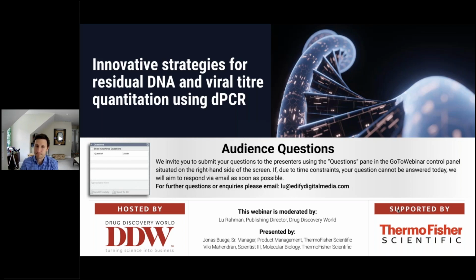Okay, thanks, Jonas. There's one final question that's just come in. Which AAV serotypes can you analyze with the AAV kit? The AAV kit is serotype agnostic, because we don't have the standard in the kit, and it's really going after targets that are present in, we measured, around 80% of commercially available plasmids, targeting ITR and SV40. So, serotype agnostic.